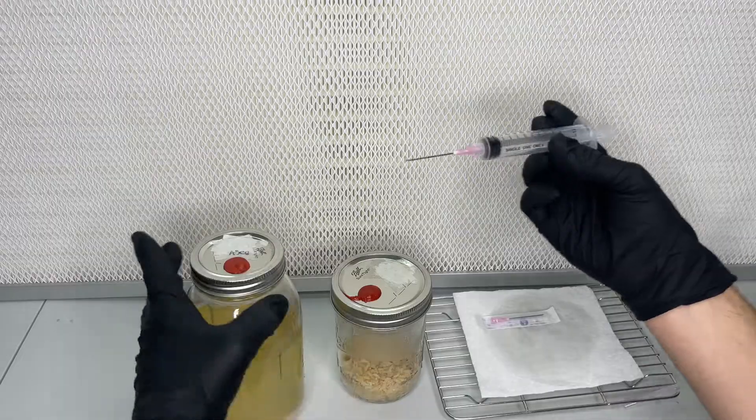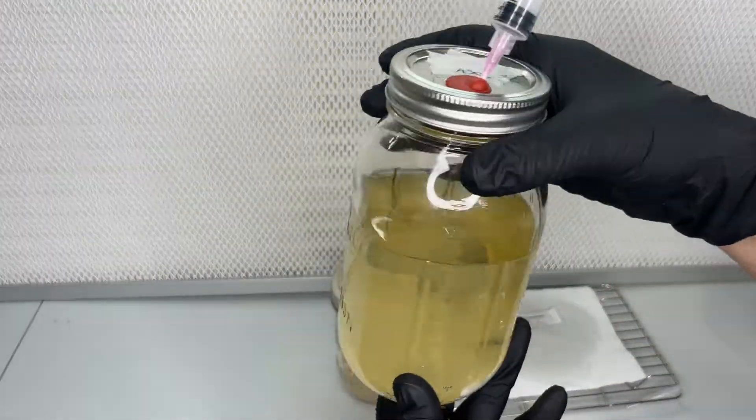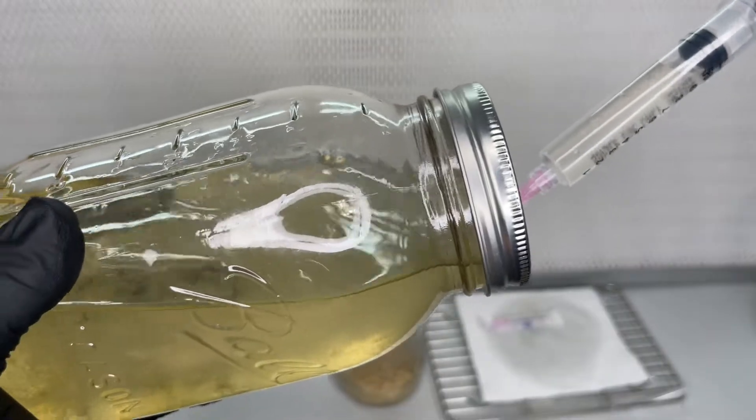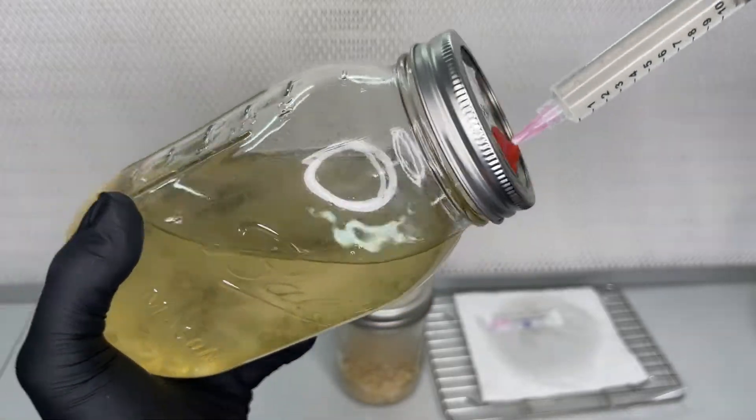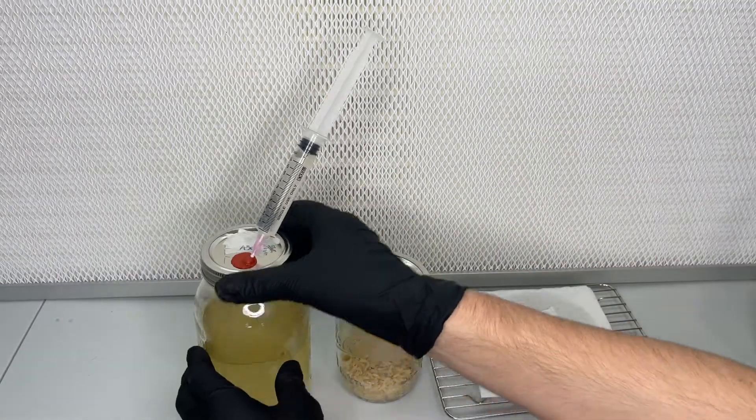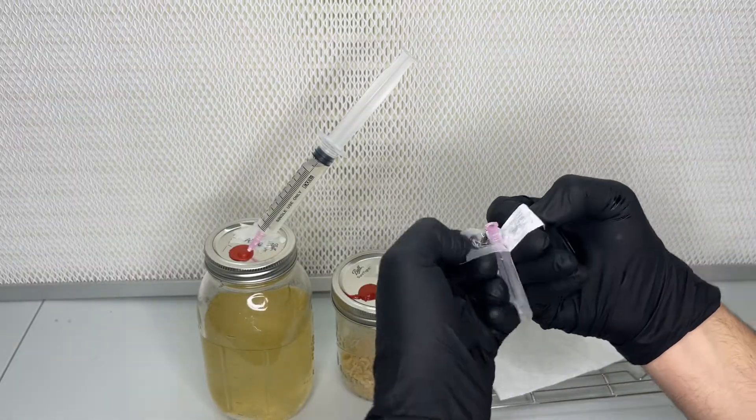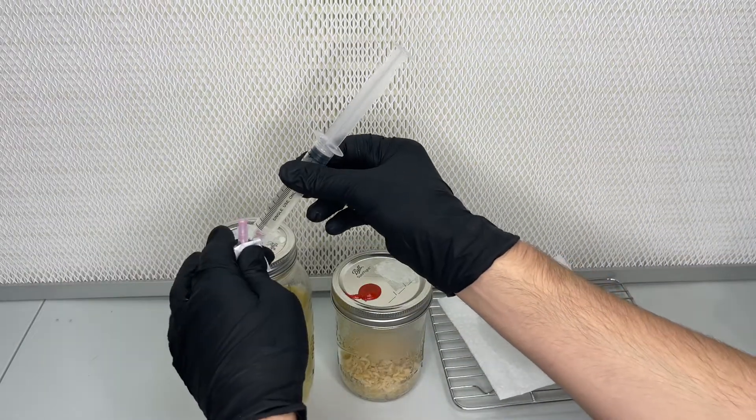I use 12 milliliters of the liquid culture and inject it into the rice jar, making sure to cover the entire surface evenly. After inoculating the rice jar, I allow it to colonize in the dark for three days at 70 degrees Fahrenheit.